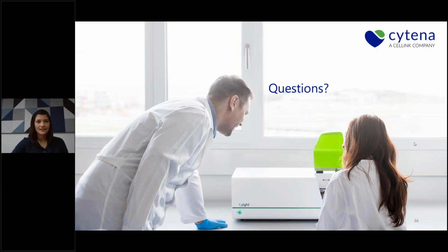Okay, we have another question. What are typical cell concentrations that you recommend for single cell printing? Good question. I would choose between 0.5 and 1 million cells per ml. But in fact, you would only use about 40-50 microliters for loading the cartridge.